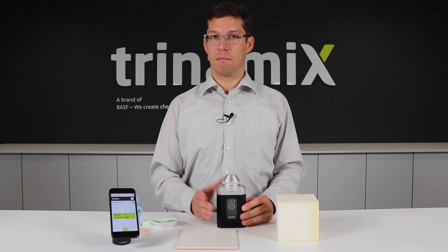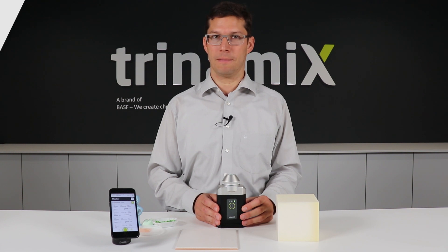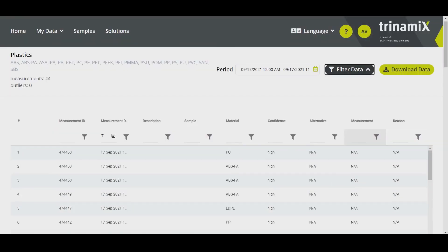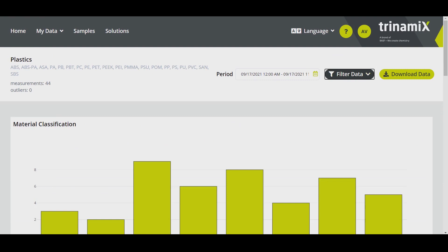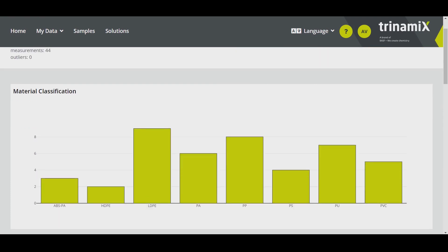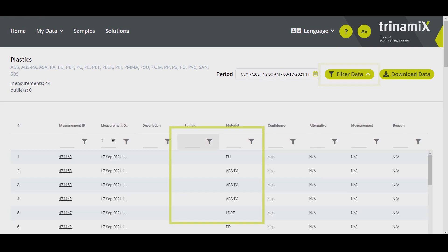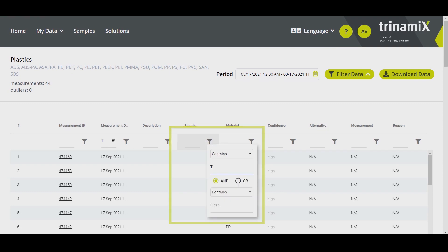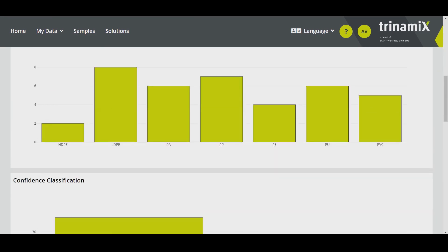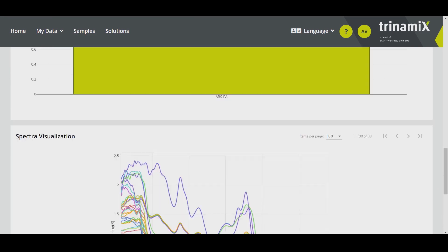Now we've performed our measurements and I'm going to show you how this looks like in our customer portal. Here you can find all your measurement results being displayed in a table or in a diagram. If you have measurements with a certain sample ID, you can filter them and look specifically for these samples in the diagram. If you scroll further down, you will also find the spectra of all these samples.